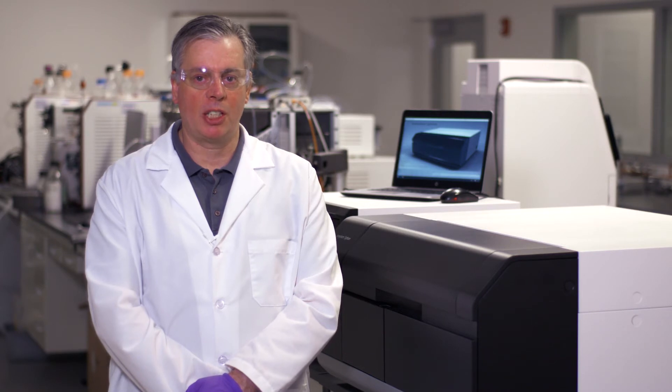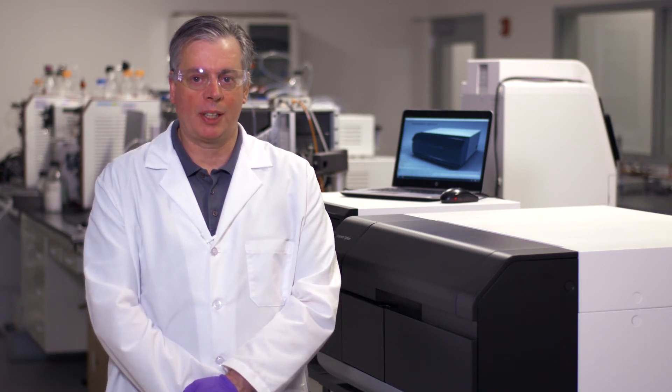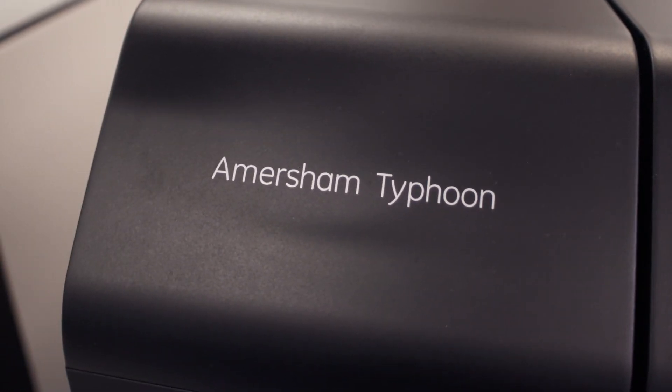Other applications we can perform with the instrument would be things such as digitization, where we're just going to capture a Coomassie silver stain gel image, but we also have the alternative to go into densitometry. In this case, the machine is being factory calibrated for optical density using the grayscale step tablet. We will perform true densitometry to be able to measure Coomassie and silver stain gels.